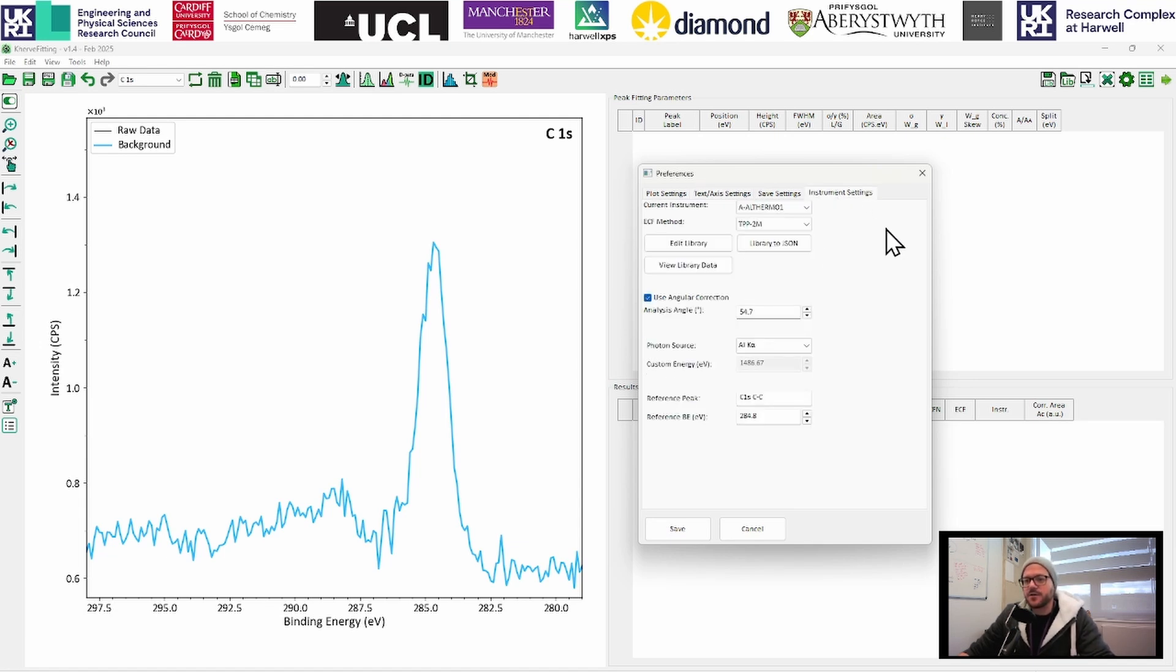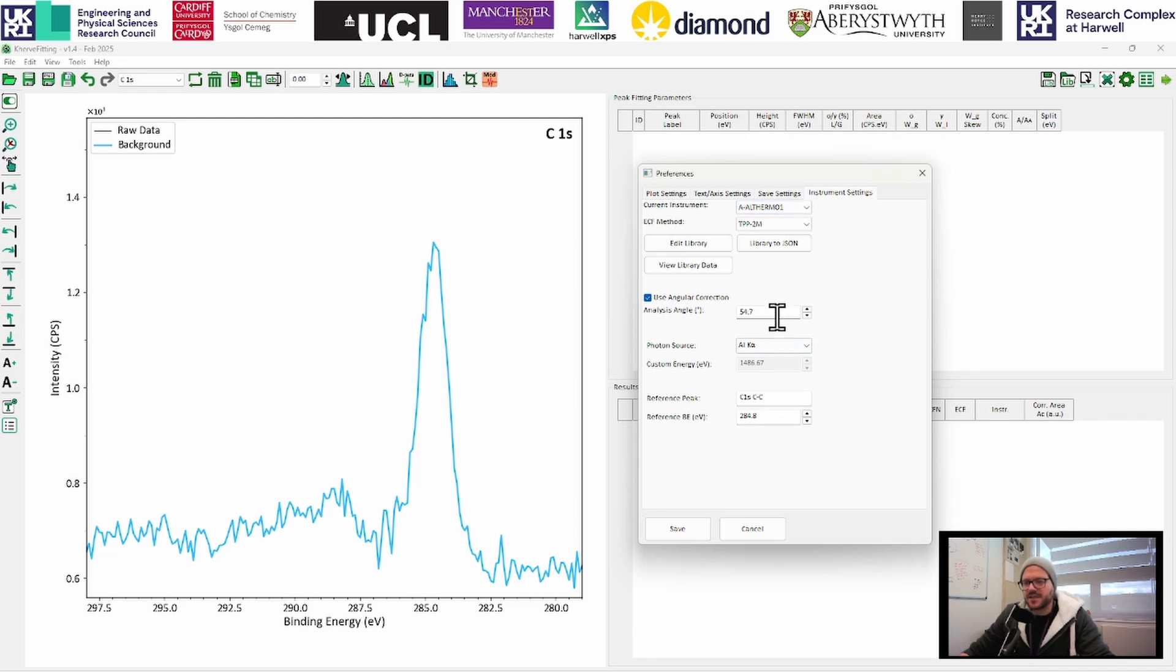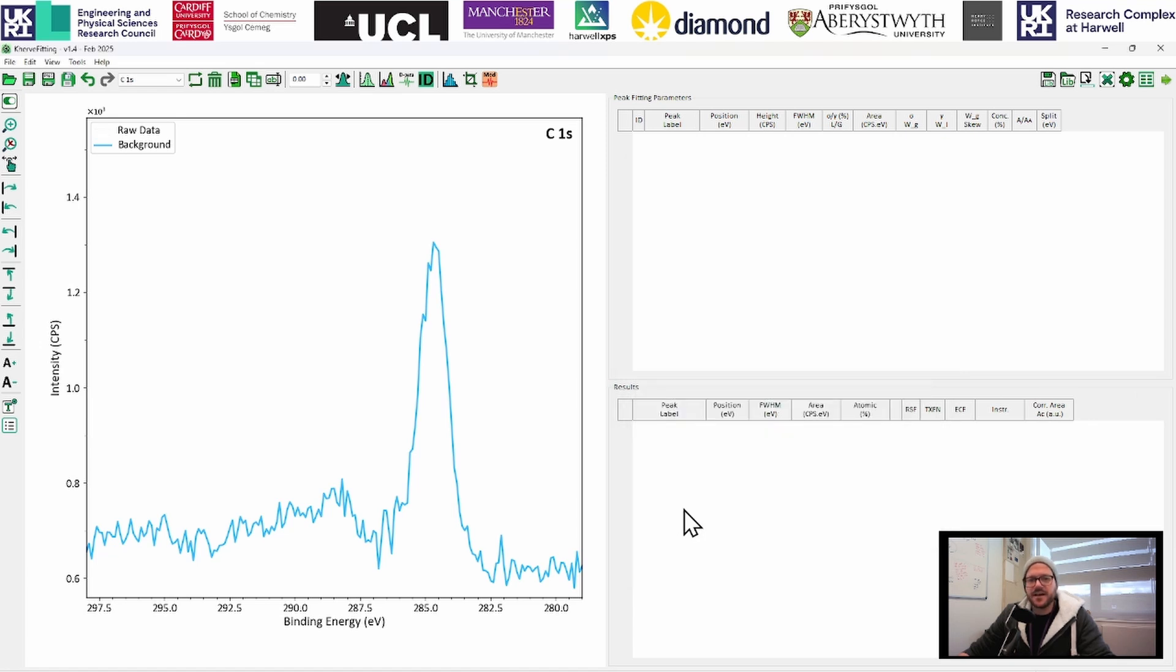If you go into the instrument settings, very useful functions in here, you can see this is just pulled from the metadata in the VAMAS file that I've opened. And you can see all the different options here. If you want to change any of your instrument settings or change the library you're using, then you can do so from there. But for now, we're just going to click save and get on with the first stage of the processing.